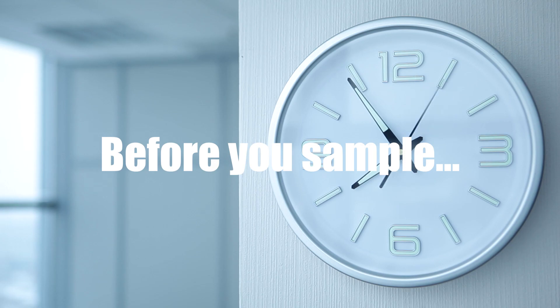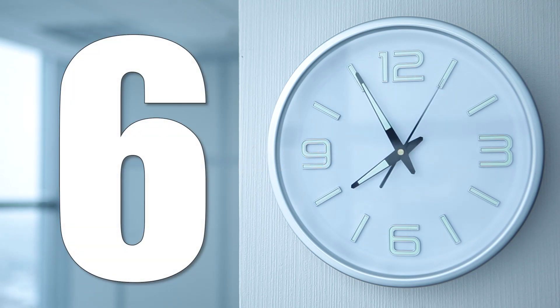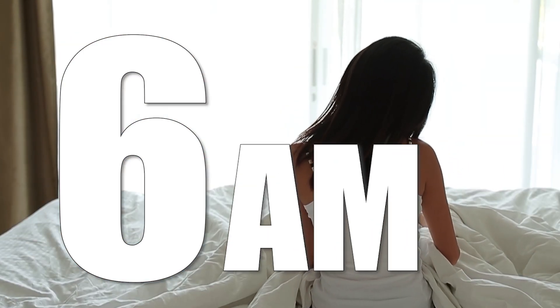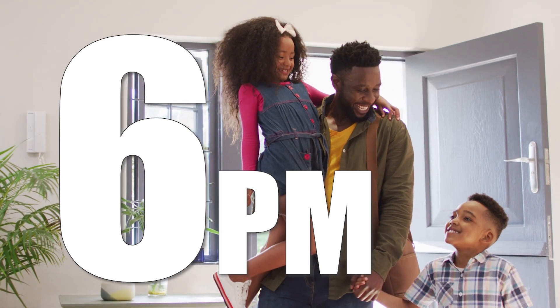Before we take the sample, make sure the cold water has stood motionless in your pipes for at least six hours. We suggest taking the sample first thing in the morning before using the water, or as soon as you get home from work.